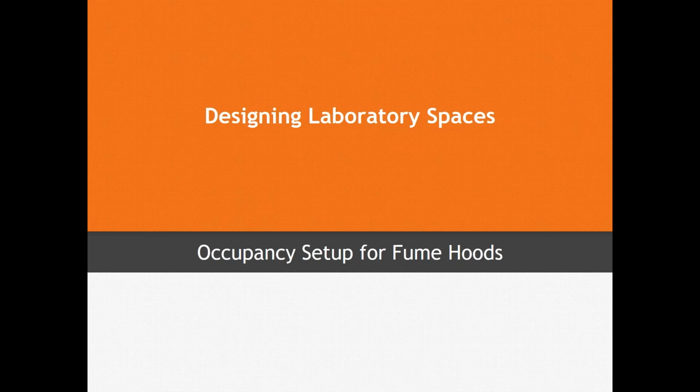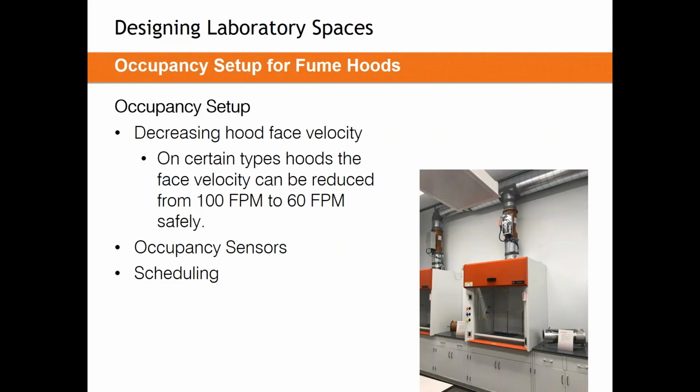So we're about halfway through here. We're about half past the hour. I think we're keeping on time here. What we'd like to talk about now is occupancy for fume hoods. Let's try to start saving some money in these well-designed labs that we now have.